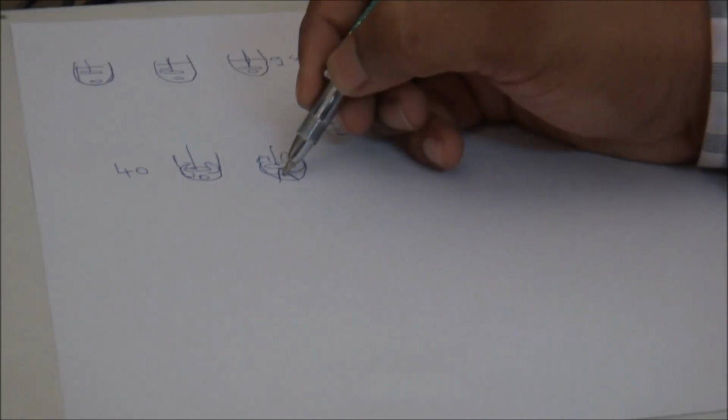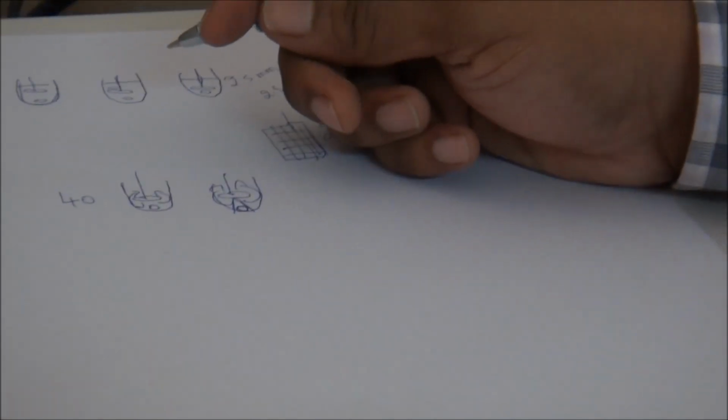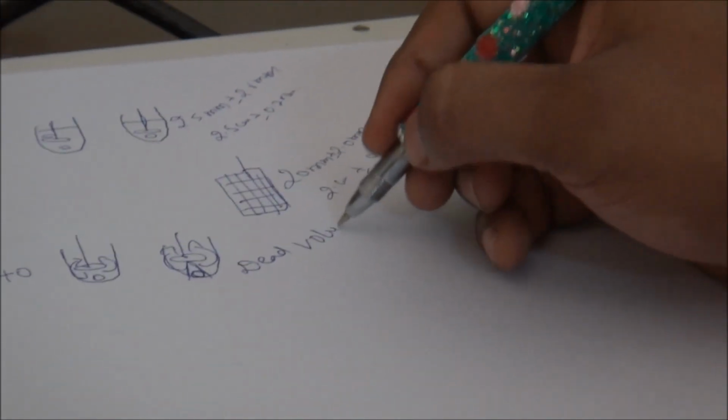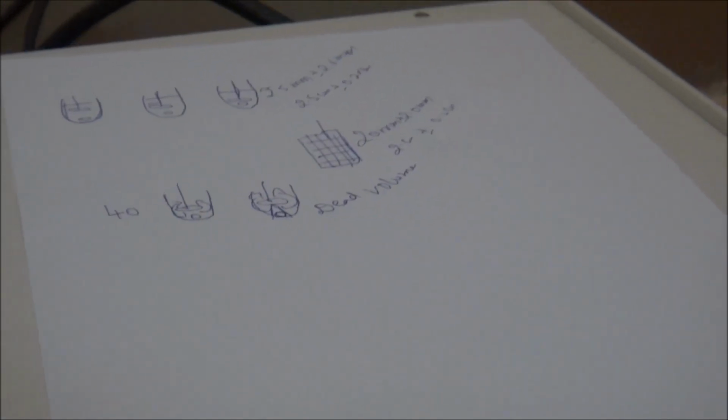And obviously, as you all know, the tablet is placed just below that area. So this volume is generally considered dead volume. A dead volume is generally observed only with the paddle type of apparatus, just below the paddle.